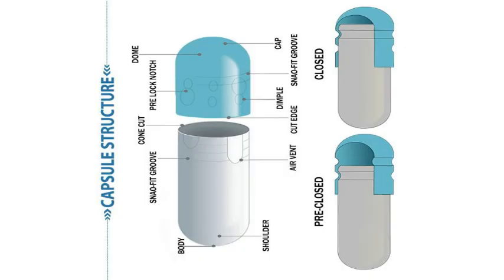So guys this was a simple animation showing the hand operated capsule filling machine and the process.